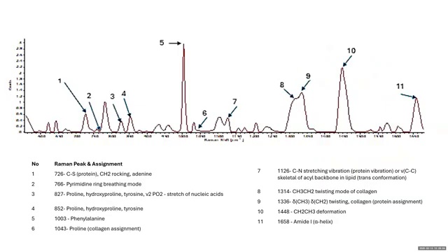This is a spectrum from a cell. A cell produces a fingerprint-like spectrum with unique detectable contributions from abundant cellular macromolecules. So each peak in this spectrum means something. For example, this peak here is the peak for nucleic acid. This peak here is for a phenylalanine protein. So we use these peak positions, peak intensities, area under the curve, peak shifts, and the shoulders of the peaks, like the shoulder of the peak here, as our information base for our analysis.